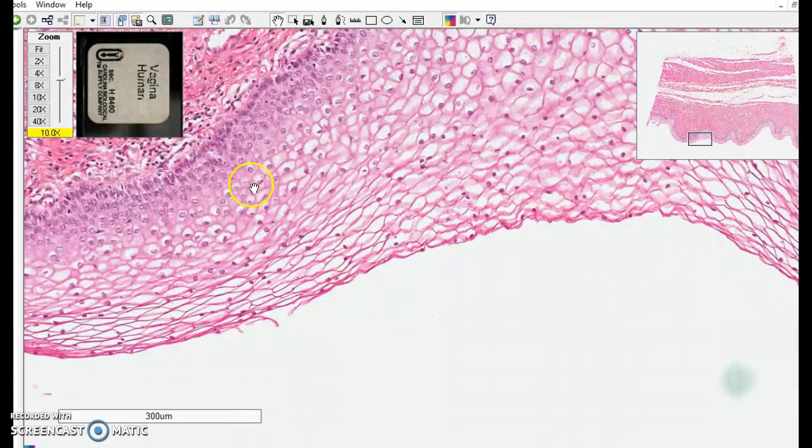So basement membrane, apical side, stratified squamous epithelium.